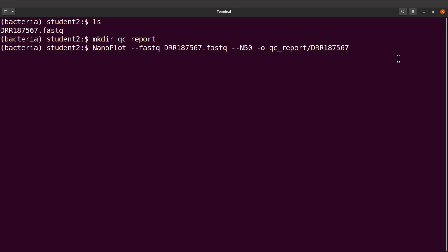And this time I'll say _raw. This is because we are going to filter the reads and then we are also going to perform QC. So I want to differentiate between the QC report for the raw reads and the filtered ones. I will do that later. All right, so let's execute this command.